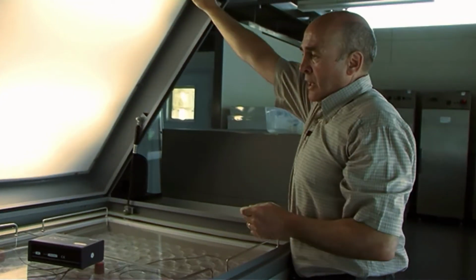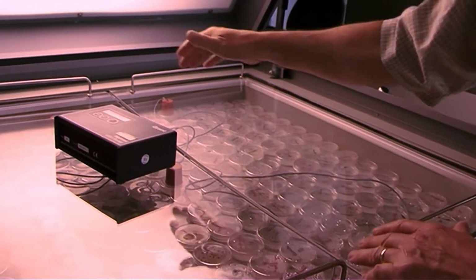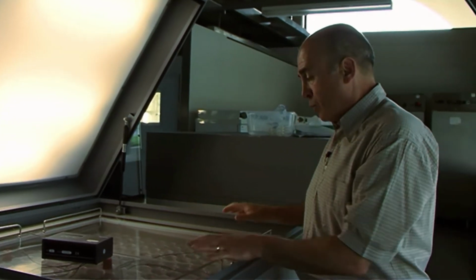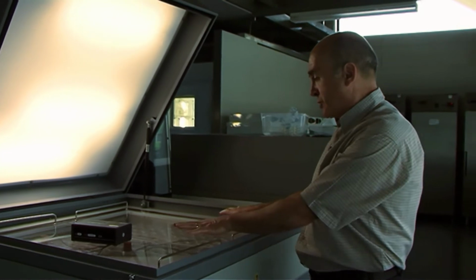When we take our collections out of the seed bank for germination testing, we need to choose the right conditions that will enable those seeds to germinate, and this very often involves a bit of detective work. This is called a two-way thermogradient plate, and the way it operates is to produce a gradient of temperature from cold to hot during the daytime in that direction, and then from cold to hot during the night in that direction.